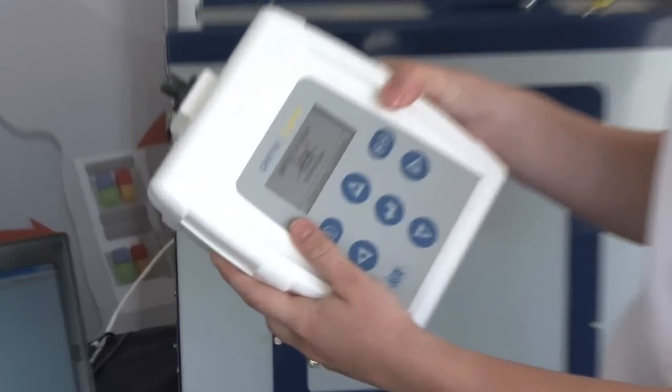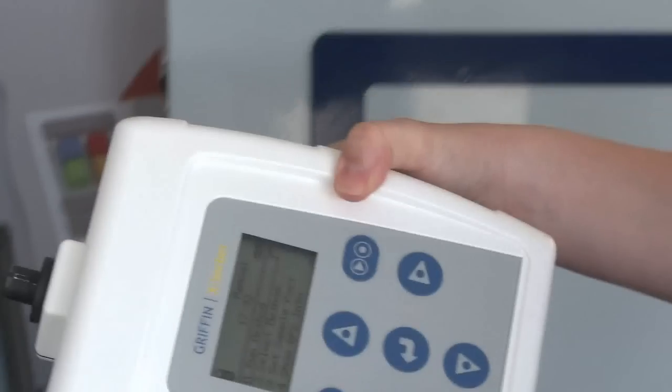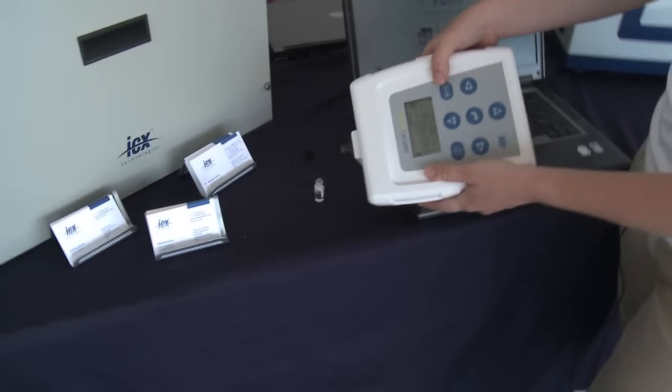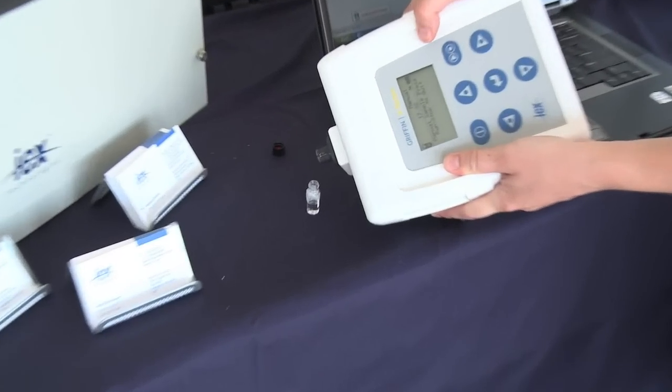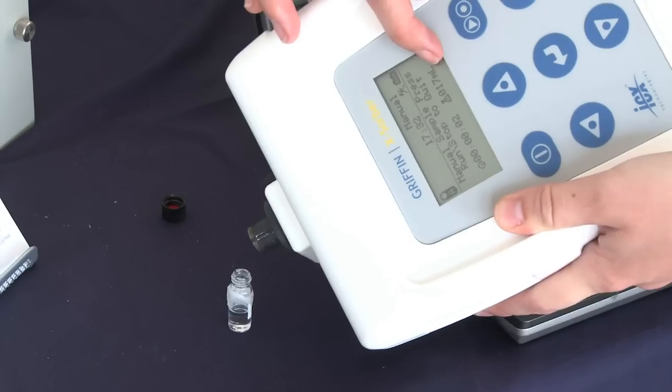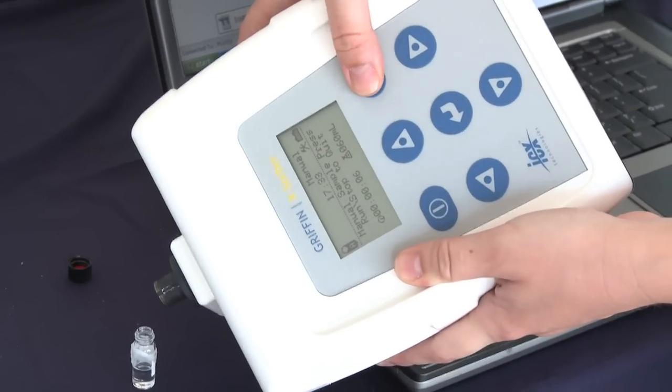We're going to take it over here and collect 60 milliliters of this clear unknown sample. I've pressed start and it's sampling. Here are the milliliters, here's the time, and we now have 60 milliliters, so I've pressed stop.